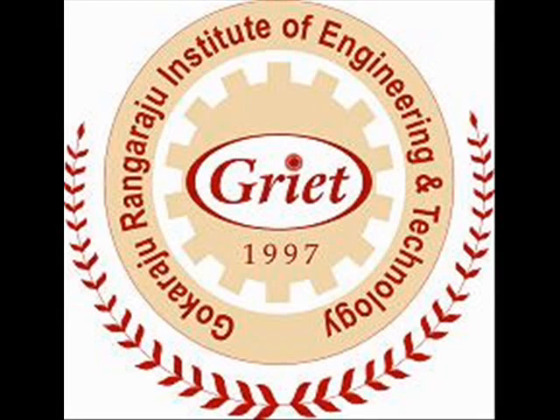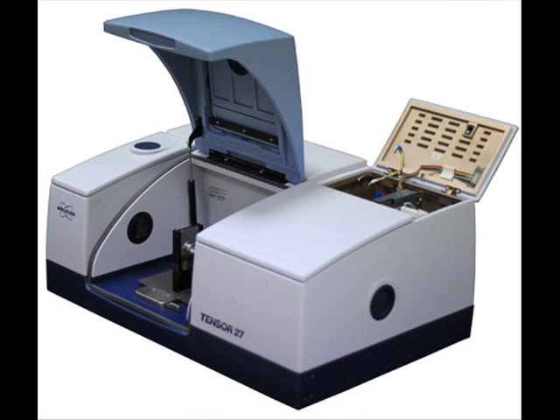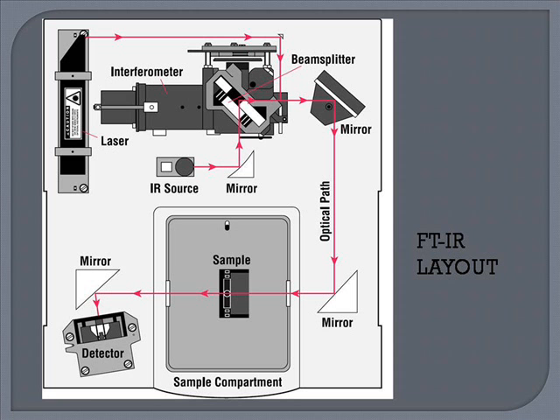We, Lakshmanjali and Haripriya, students of GRIT Biotechnology, have done a project on Fourier transform infrared spectroscopy, that is FTIR. FTIR works on the principle of an infrared source that emits a broad band of different wavelengths of infrared radiation. The IR radiation goes through an interferometer that modulates the infrared radiation. The interferometer performs an optical inverse Fourier transform on the entering IR radiation.